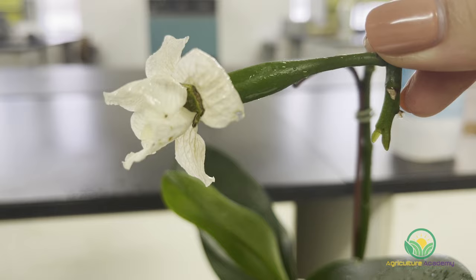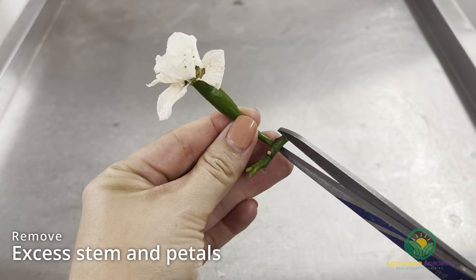We then removed any excess stem and remaining flower petals. For the rest of the video, we will be flasking some Cymbidium seed as an example.